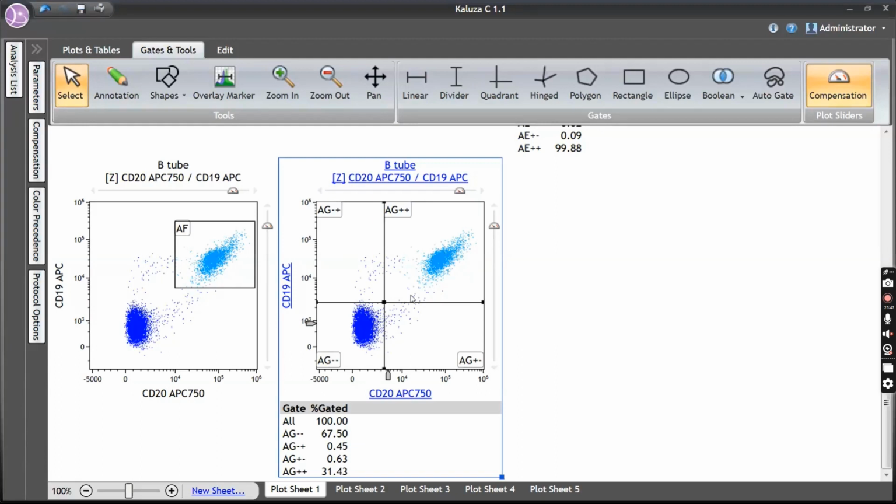So in cases where we don't have the internal controls, how? That will be challenging and you need to do it with your experience. See, at least there will be some lymphocytes. Here there is a good number, but in some cases, when the marrow is florid with blasts, there are no lymphocytes at all. But I'll tell you, there should be some T lymphocytes. So there will be some negative control to help you. There may not be normal B cells, but some normal T cells will be there. It's very rare to find only blast.